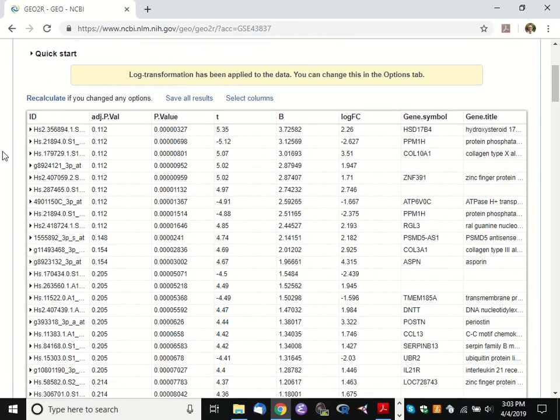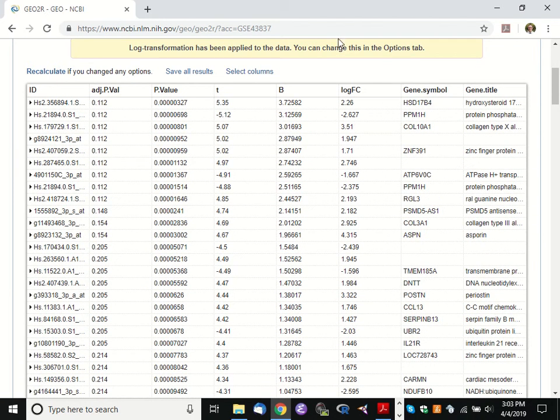ID of the probe. Okay, so the gene symbol is way over here. Do you guys know how complex the process was that ironed out what gene symbols shall be used for all 20,000 human protein coding genes? It was long, laborious, and painful. But the Human Gene Naming Consortium has this final recommendation, and everybody follows it perfectly, I'm sure.